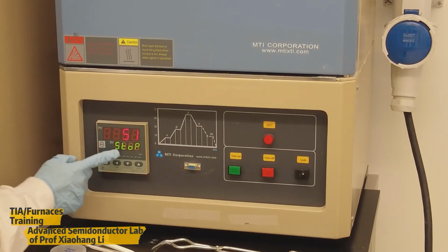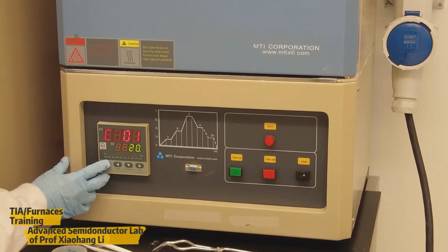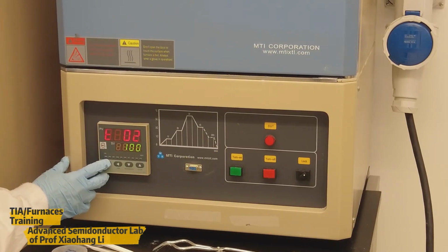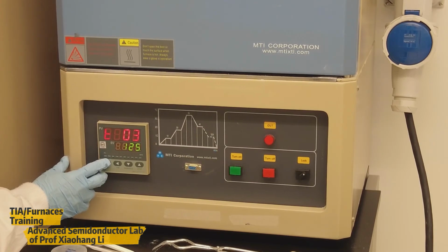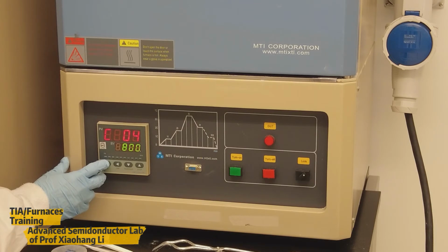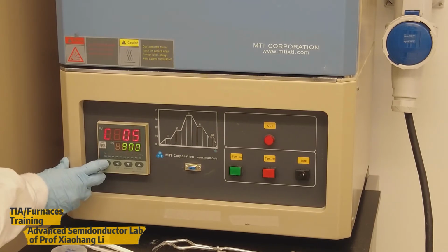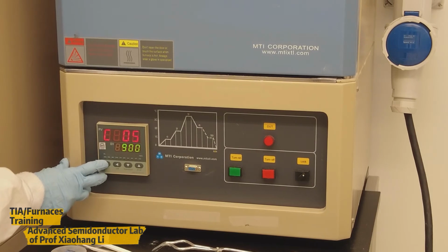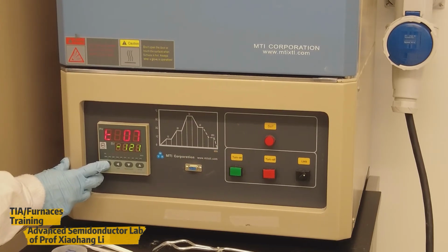Set point shows stop, and then push this one to check all the settings. 300 degrees C, 125 to 800 degrees C, and then to the set point we want to reach, 900 degrees C for 3 hours. Then ramp down to 200. Then finish the program.